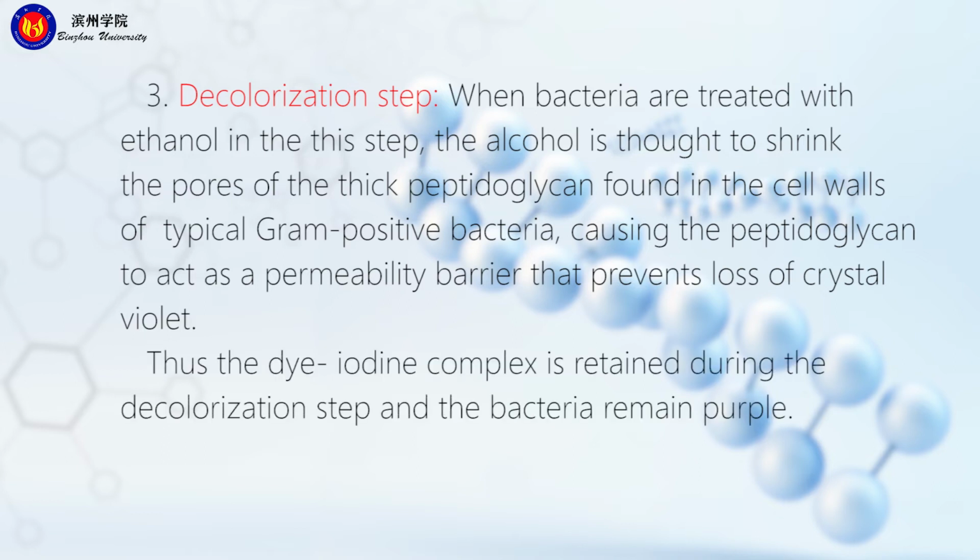Thus, the dye-iodine complex is retained during the decolorization step, and the bacteria remain purple.